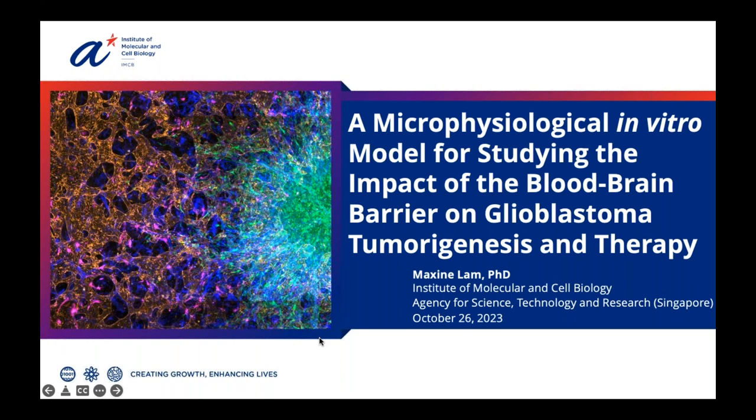Good morning, everyone, and thank you for joining us for our webinar, Unlocking Breakthroughs in Glioblastoma Research. Today's presentation will cover the development of a functional in vitro human blood-brain barrier in glioblastoma model to investigate mechanisms of drug resistance using AIM Biotech's organiX platform.